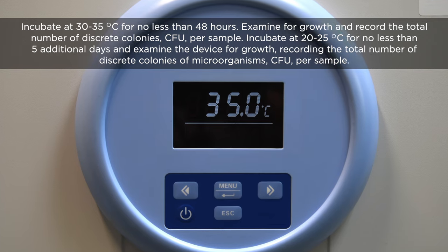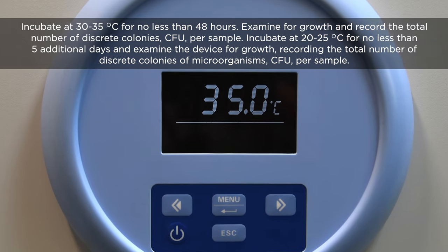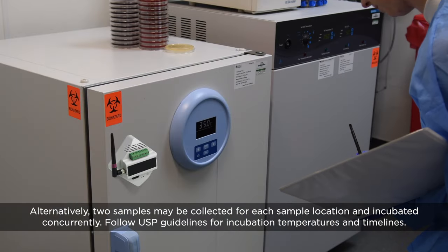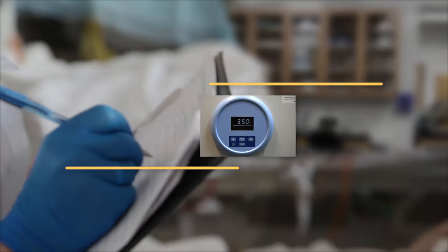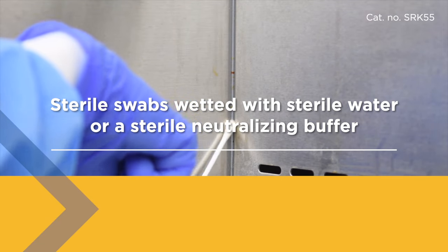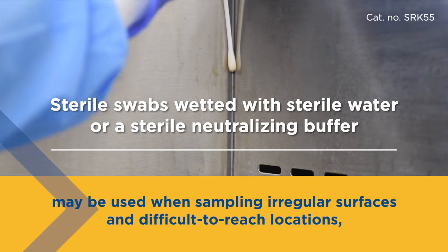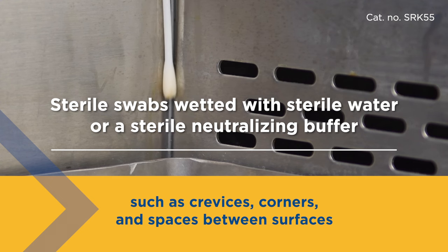Samples must be incubated in a calibrated incubator at temperatures that will promote growth of bacteria and fungi. The incubator temperature must be monitored during incubation, either manually or by a continuous recording device, and the results must be reviewed and documented. Sterile swabs, wetted with sterile water or sterile neutralizing buffer, may be used when sampling irregular surfaces and difficult to reach locations, such as crevices, corners, and spaces between surfaces.